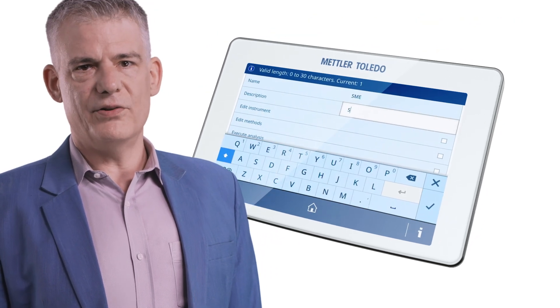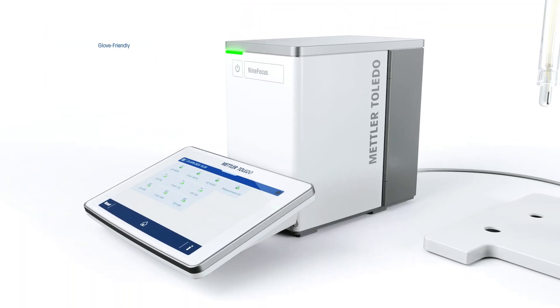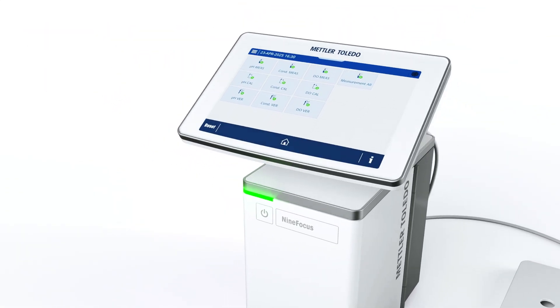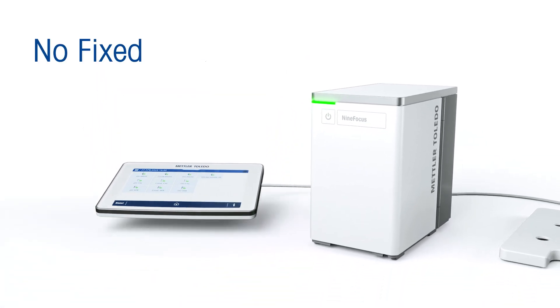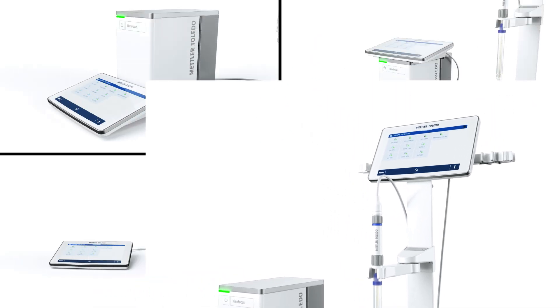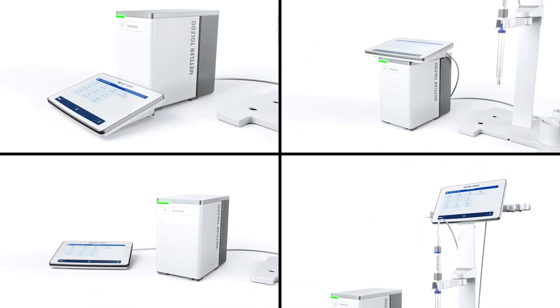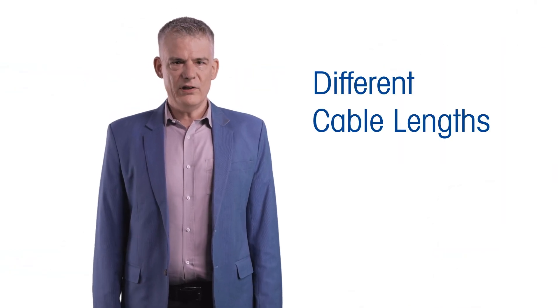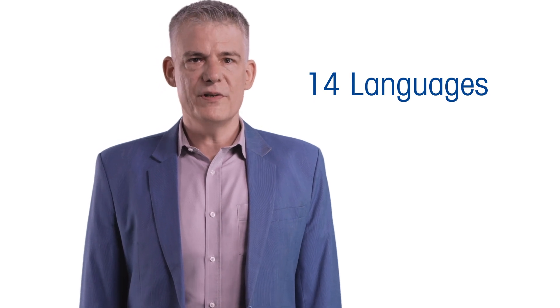The user management even allows you to tailor user groups. The touchscreen is glove-friendly, avoiding the hassle of taking gloves on and off just to press a button. And you're not tied into a fixed location — lock the terminal in front of the meter, on top of the meter, freely on the bench, on top of the EasyPlace electrode arm, whatever works best for you. With different cable lengths for the terminal, you can operate the system safely even when working under a fume hood. The 14 supported languages of 9Focus ensure it's accessible to labs around the world.